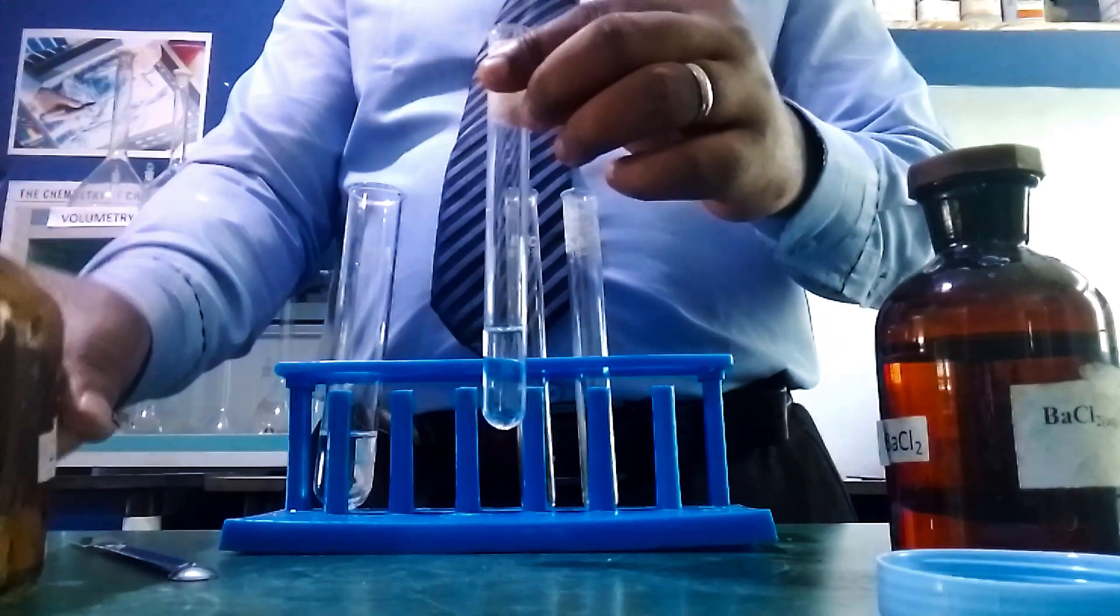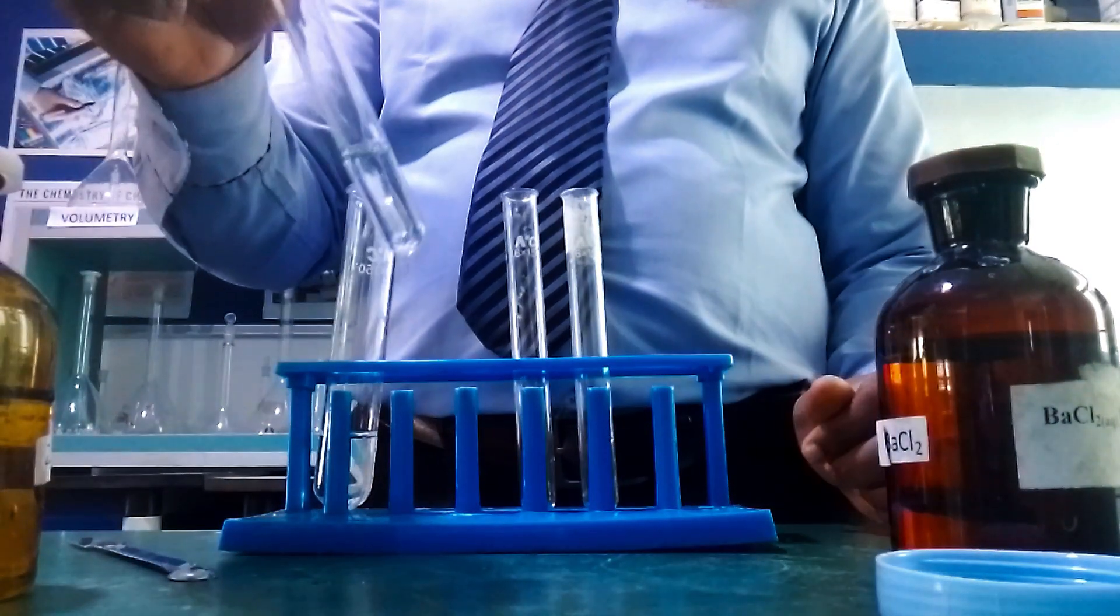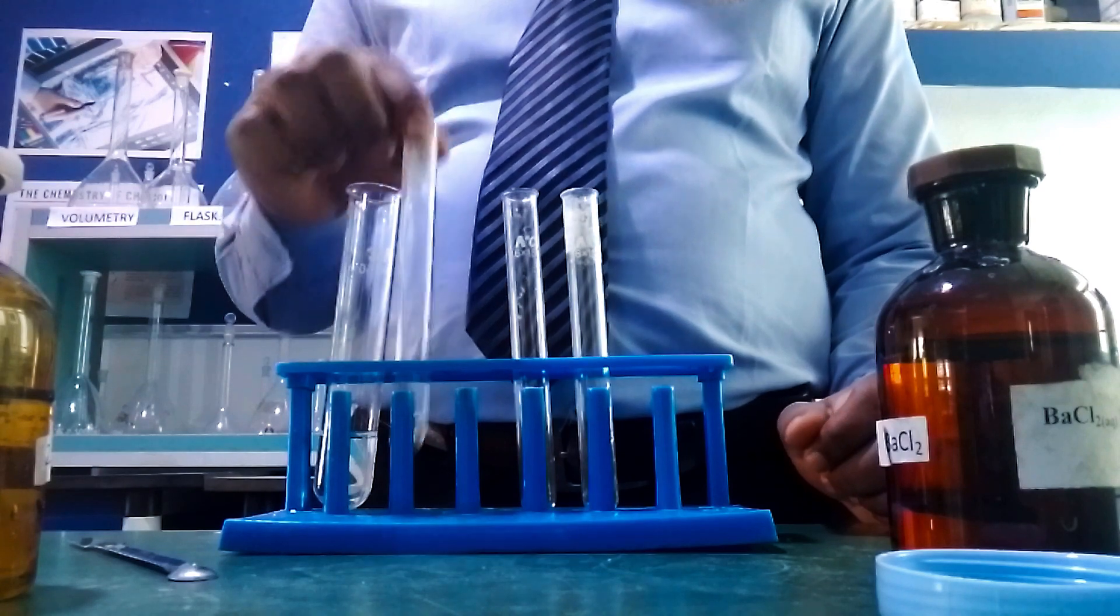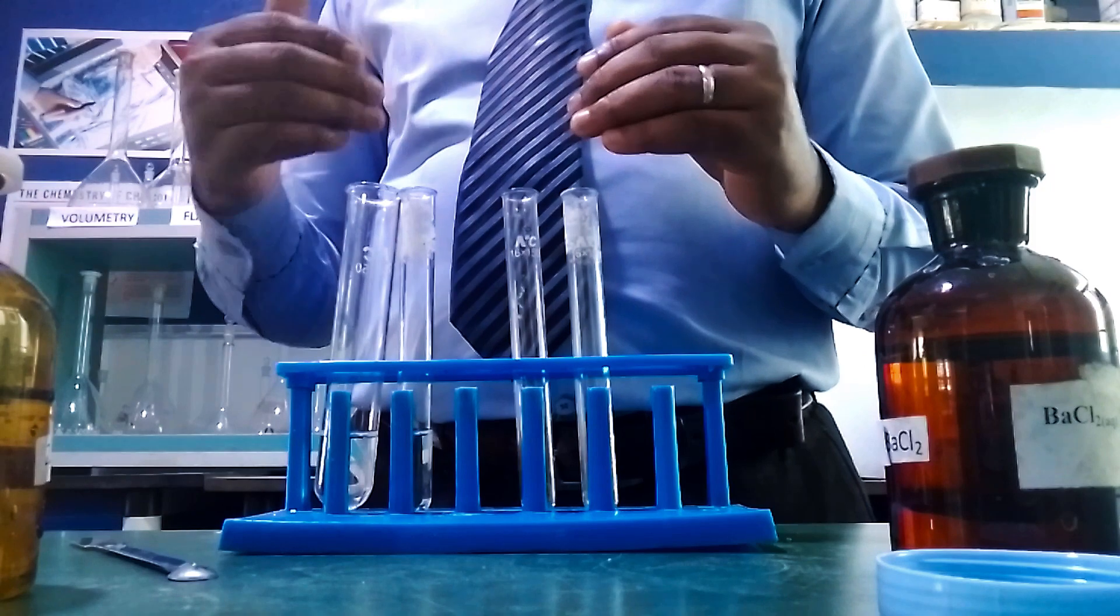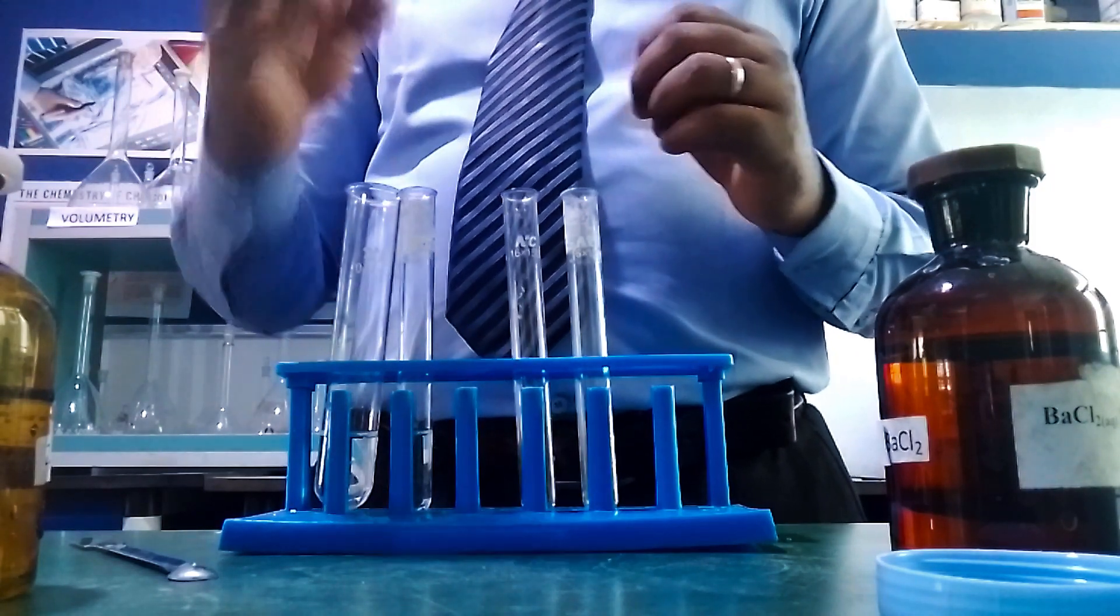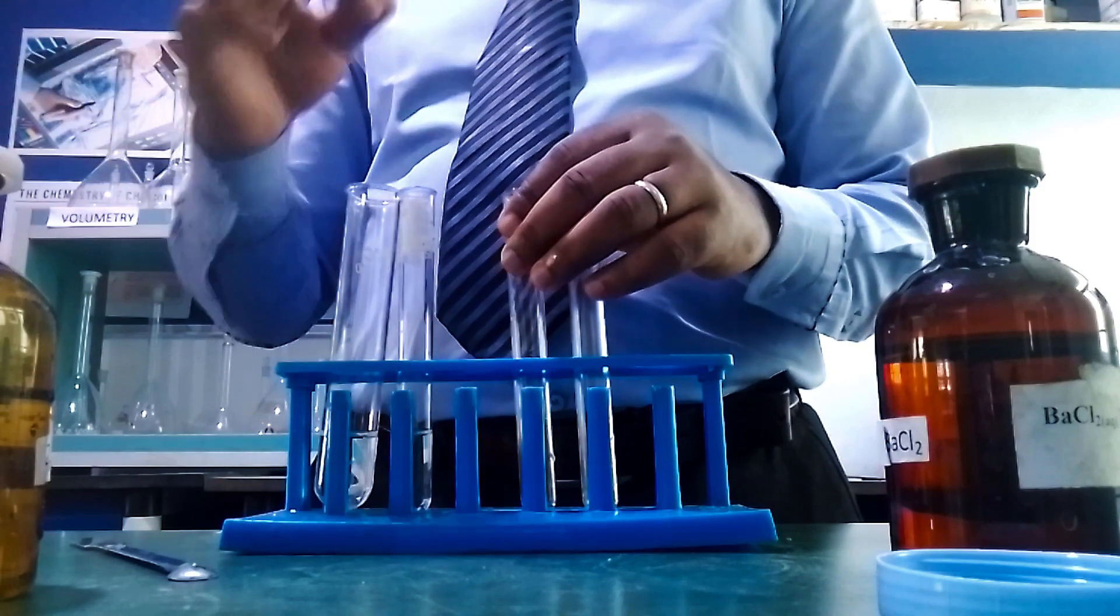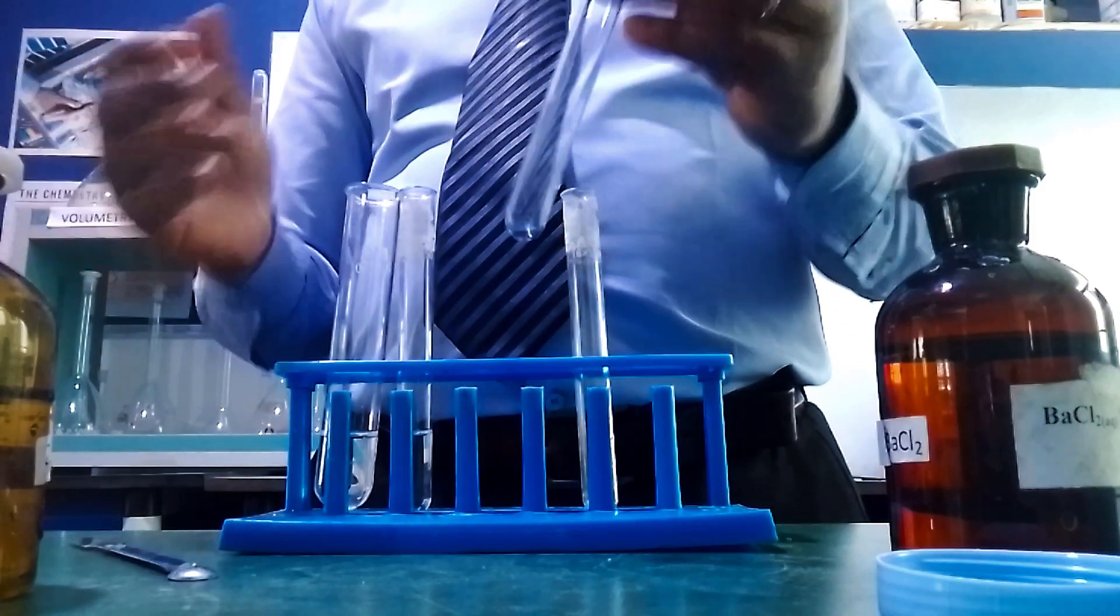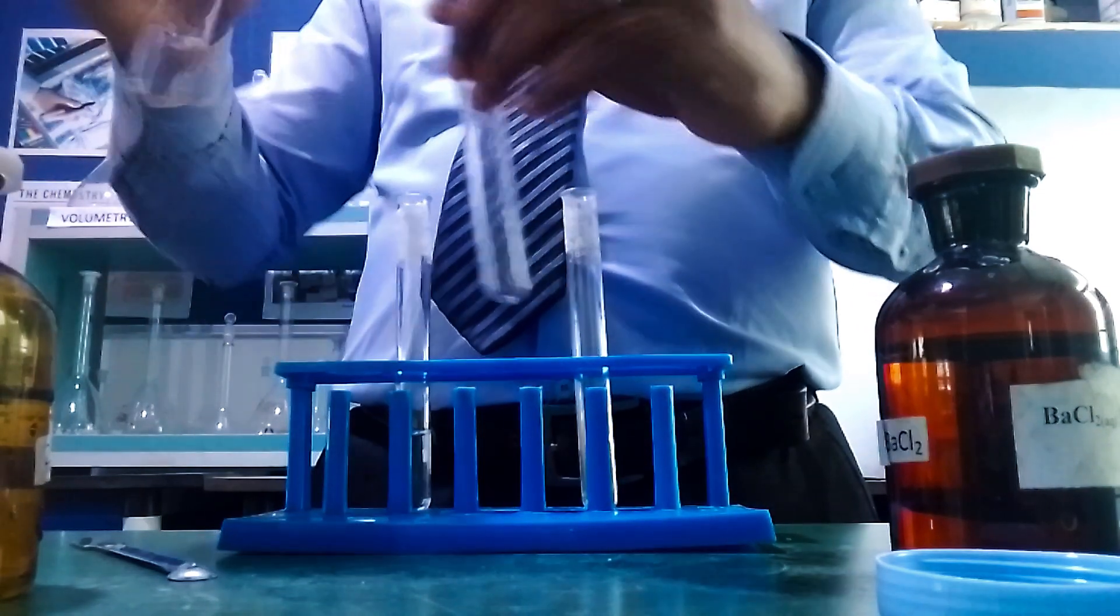This colorless, odorless gas produced when acid is added will turn moist blue litmus paper red and also turn lime water milky. Next test: take another portion of the solution.